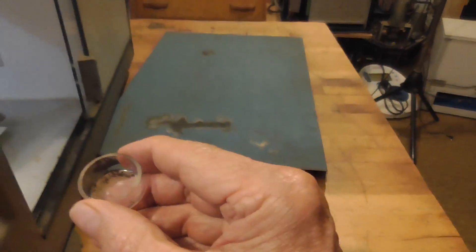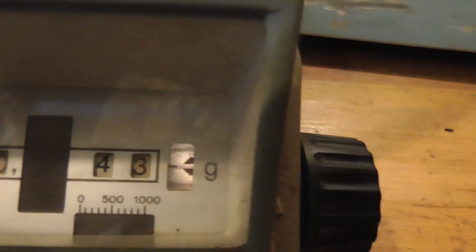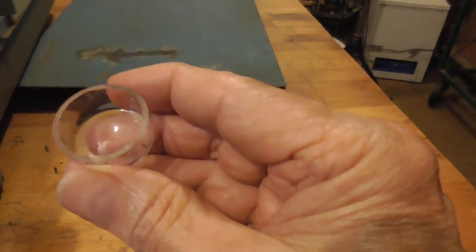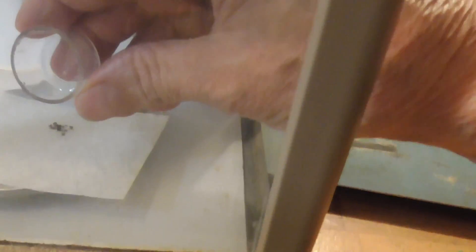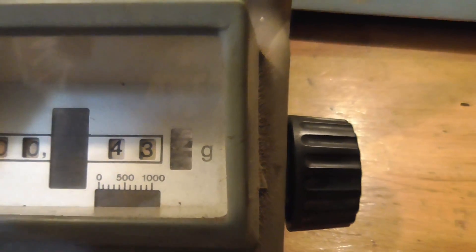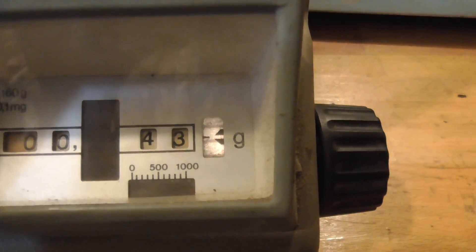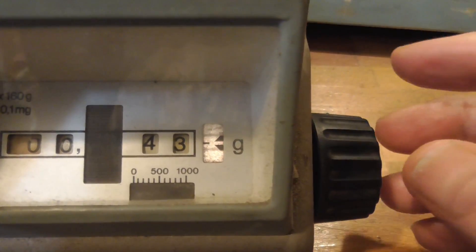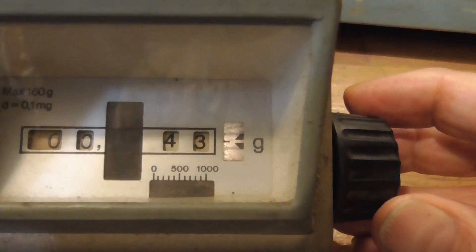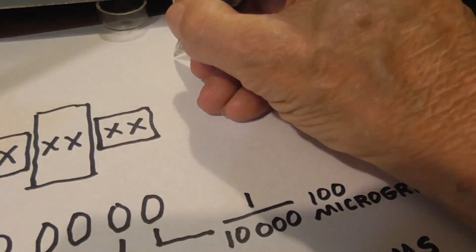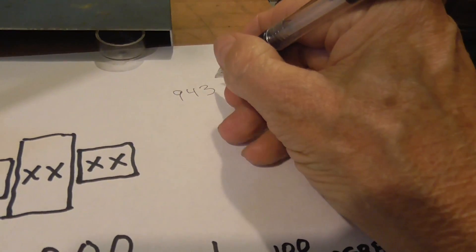Now, I'm going to go ahead and take the fleas and I'm going to dump them onto the scale. We look very carefully at our scale. We're perfectly balanced at 943. The fleas are just sitting in here and I'm going to go ahead and dump them now onto the scale, onto the piece of paper. All right, that's all of them. Now let's see what happened. If we look at our scale, see, we've gone up. We're no longer balanced. We're still at the nine, but clearly we're away from nine. So 943 and I'm going to go ahead and bring it back to zero. I've got to write these numbers down so I don't forget them. Null equals 943 is our starting number.